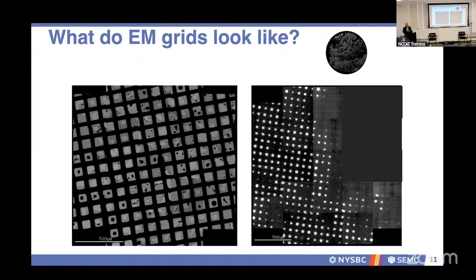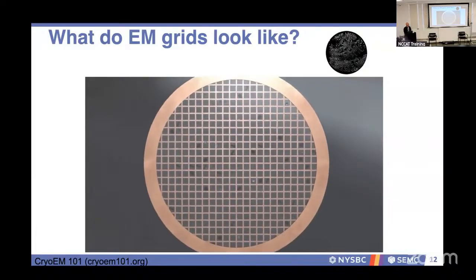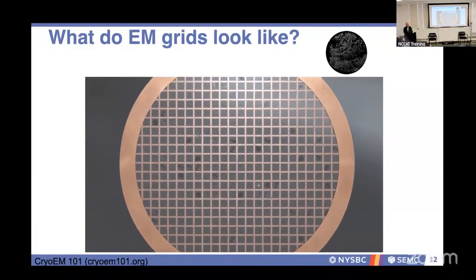And I think the task would be to try to be as critical as possible in each of the steps, because again, computation can only do so much, instrumentation can do so much. Sample preparation ends up being very valuable in the throughput and the reproducibility.